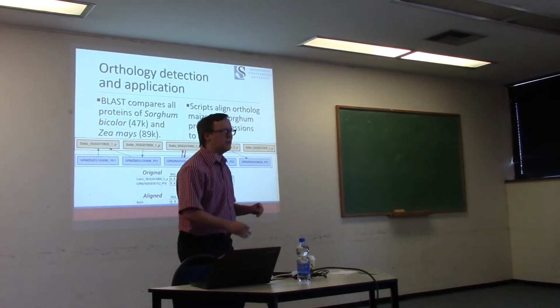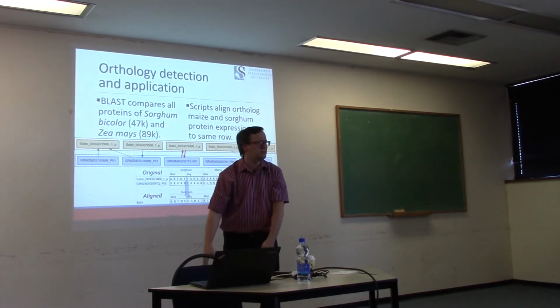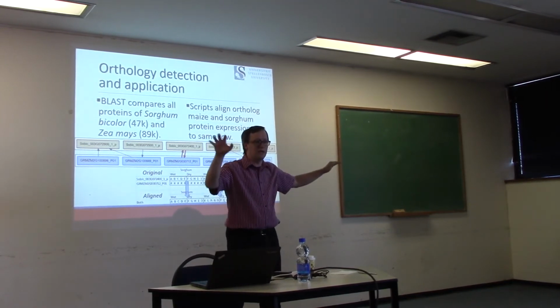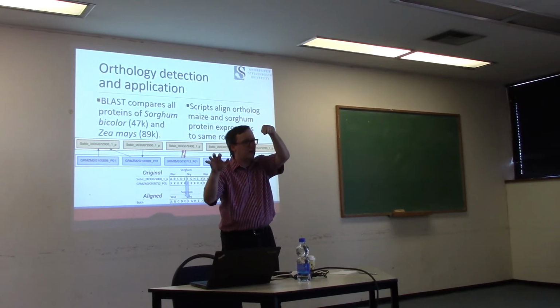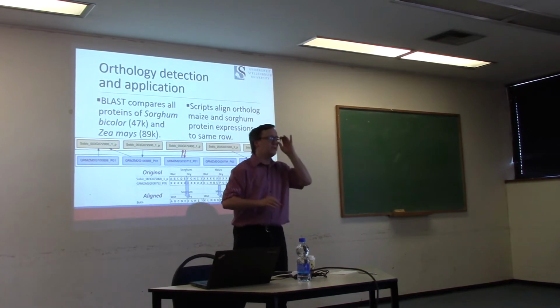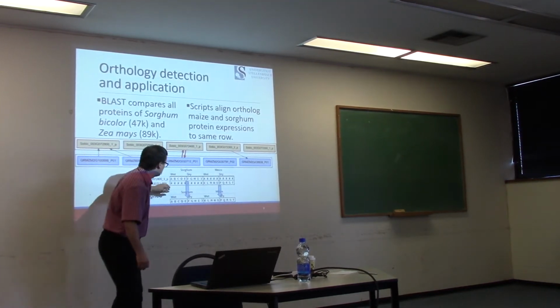Now this is a bit messy. I want you to imagine that we have a long table, say 1,000, 2,000 proteins, whatever it is tall, and then we have 20 columns for it. For each protein, we say how many spectra in this particular raw file match to this protein. That's a spectral count table. So we have 20 columns, we have 2,000 rows, whatever the number was.